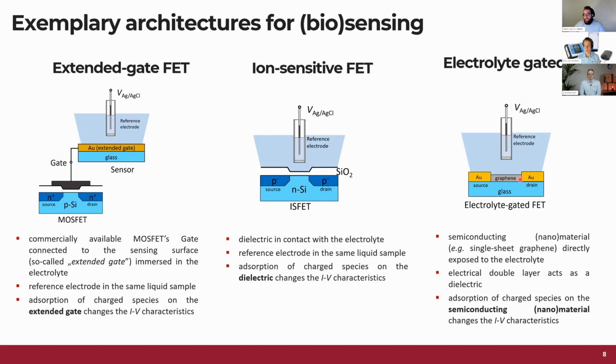So this is a very emerging field, and people are pushing that forward, and I'm actually trying to push it as well. Today, we will cover mostly the extended gate field effect transistors, which in principle anybody can measure in their own labs, basically at this time even.